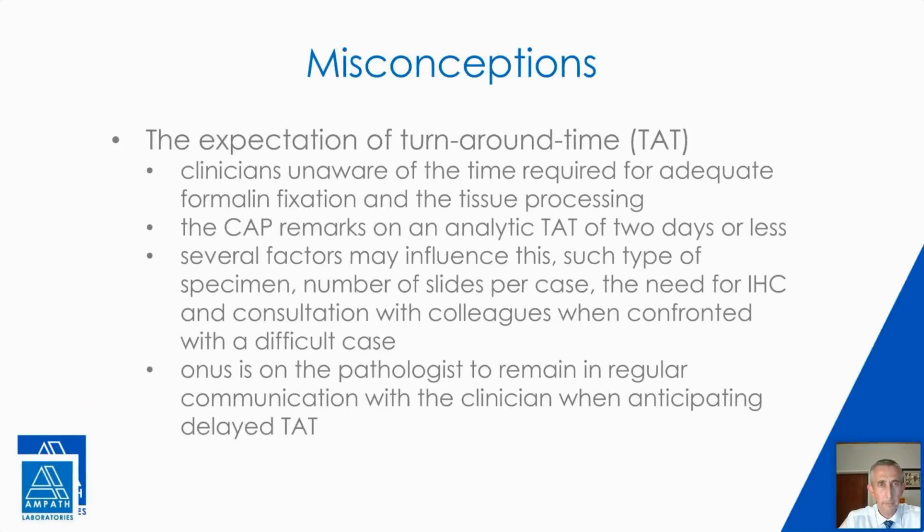Another misconception entails our turnaround time, or the expectation of turnaround time. Many clinicians are unaware of the time required for adequate formalin fixation and tissue processing, and I hope I have explained that. The College of American Pathologists, the CAP, remarks on an analytic TAT of 2 days or less, and by that I mean once the case lands on our desk.